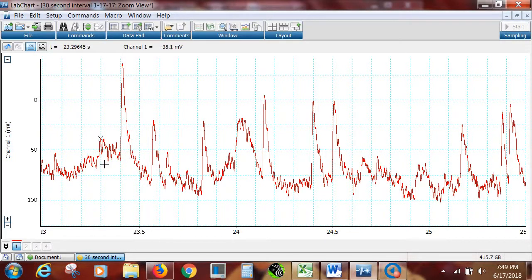So we could be a little conservative, or we could be more stringent and say we're only counting big events that are like 2 times the size of the noise. So if we see the noises from here to there, well, we want something then twice that size. We're only going to count those. Now let's look over here what the problem might be right here. Are these 3 events then? Because that's maybe about twice that noise coming through here.